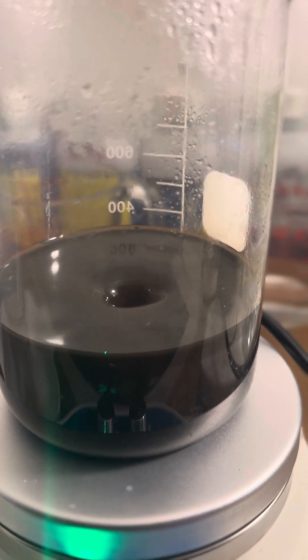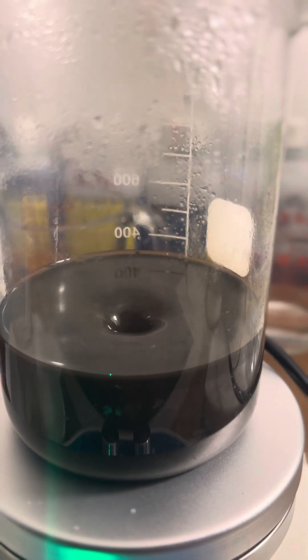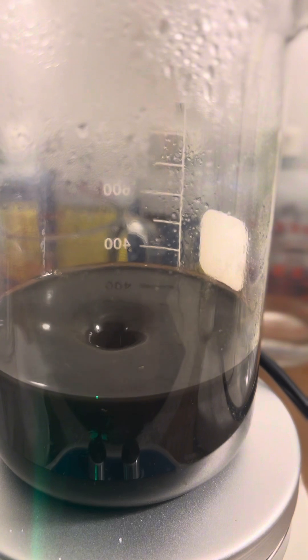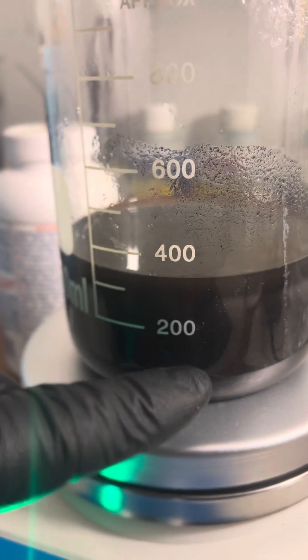I've increased the stir rate and we're just going to let that stir for about fifteen minutes. I'll add some water and then start cleaning it up. We have a little bit of mirroring right here — you can see that. Pretty cool.